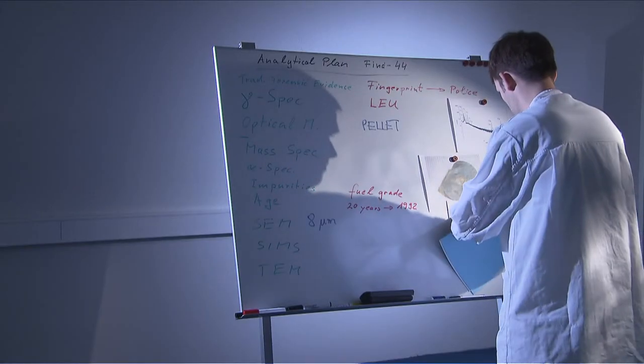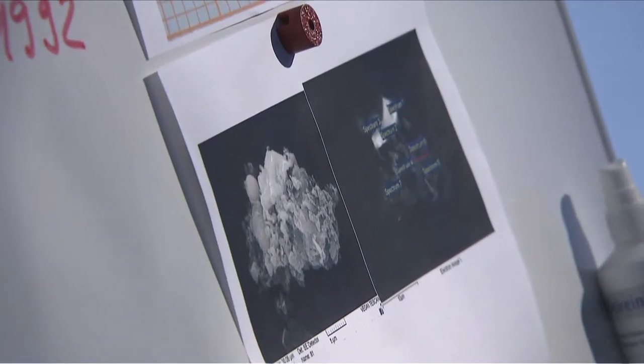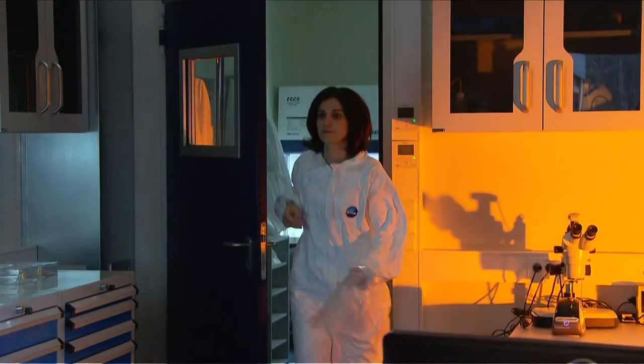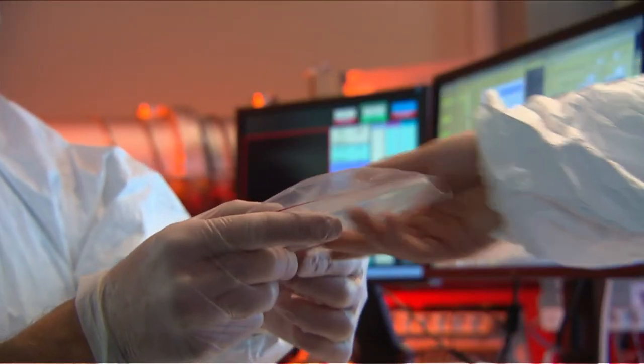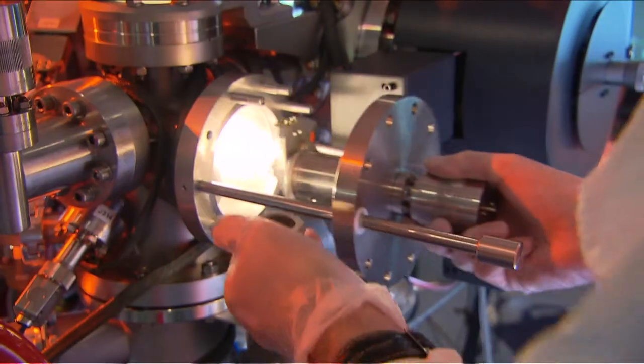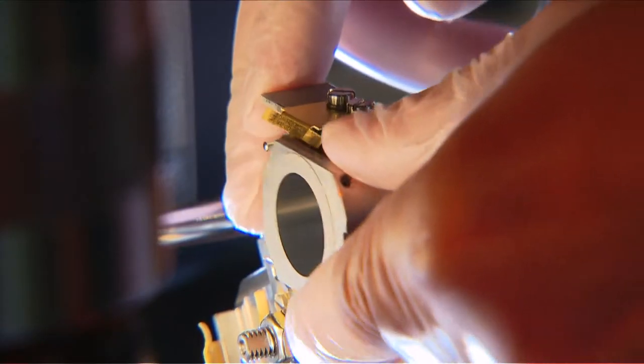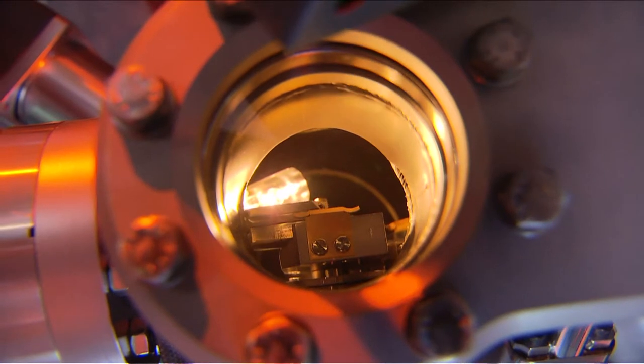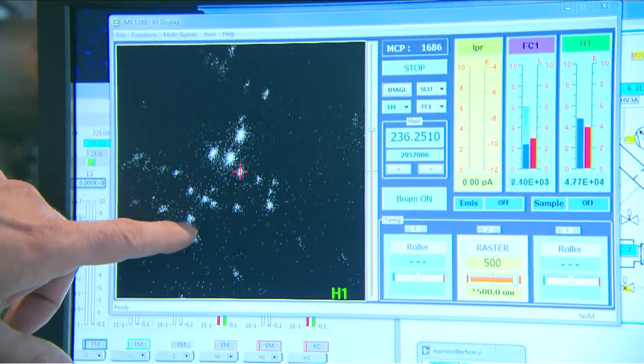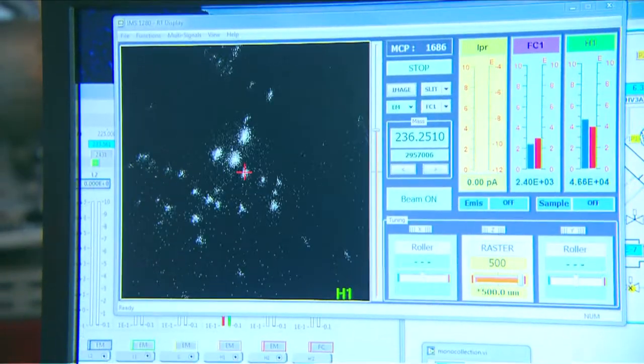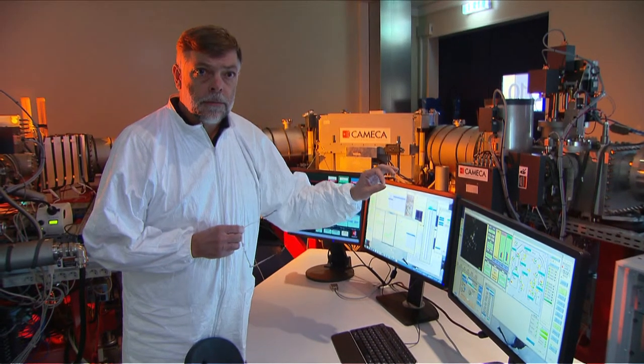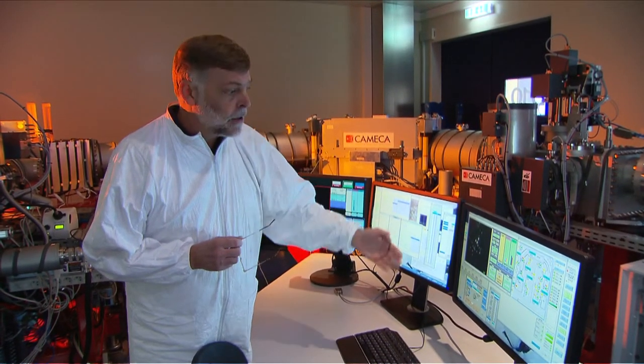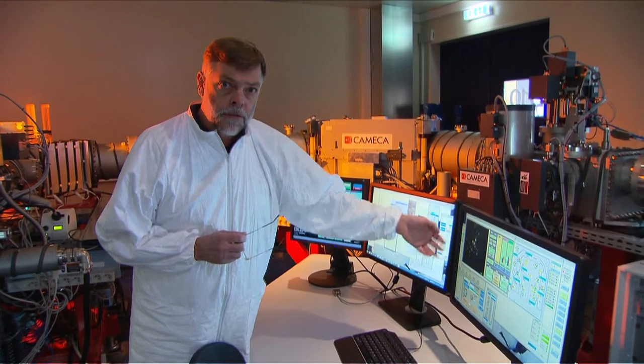The next step, investigating the sample with a unique instrument, the SIMS. The packaging that surrounded the seized material will tell Magnus Hedberg more about its intended use. This instrument can detect particles down to a few hundred nanometers. And fully automated measurements can search through some 20 to 30 million particles to find the exact location and the enrichment of the individual particles. And this information works as an isotopic fingerprint that helps us understand what the intended use is for the material.